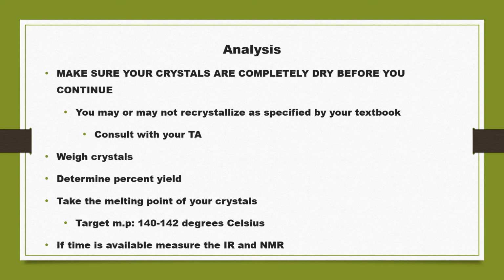For solid sample products, it's always advisable to conduct melting point, because it will tell you if you got your pure sample or not. In that case, you may need to do the experiment again, or you may need to recrystallize, for that matter, if you have impurities in the sample. For information, the melting point of acetylsalicylic acid is between 140 to 142.